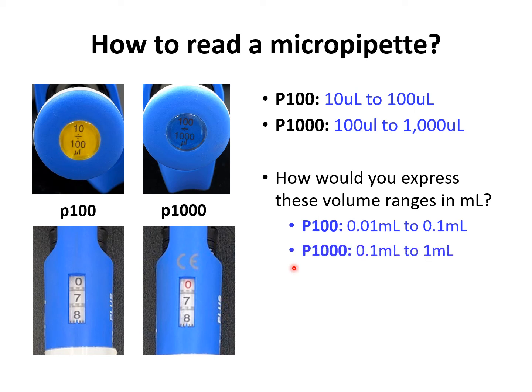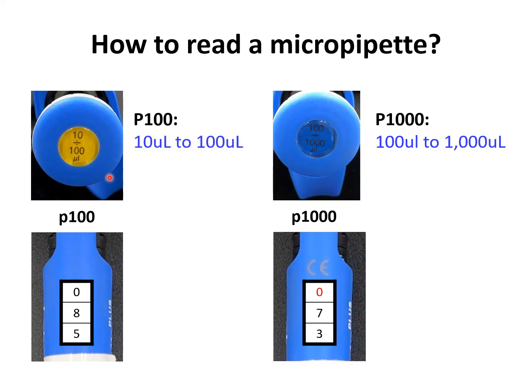So again, try out those conversions yourself and see if you get these numbers right here. Okay, let's talk about the P100.